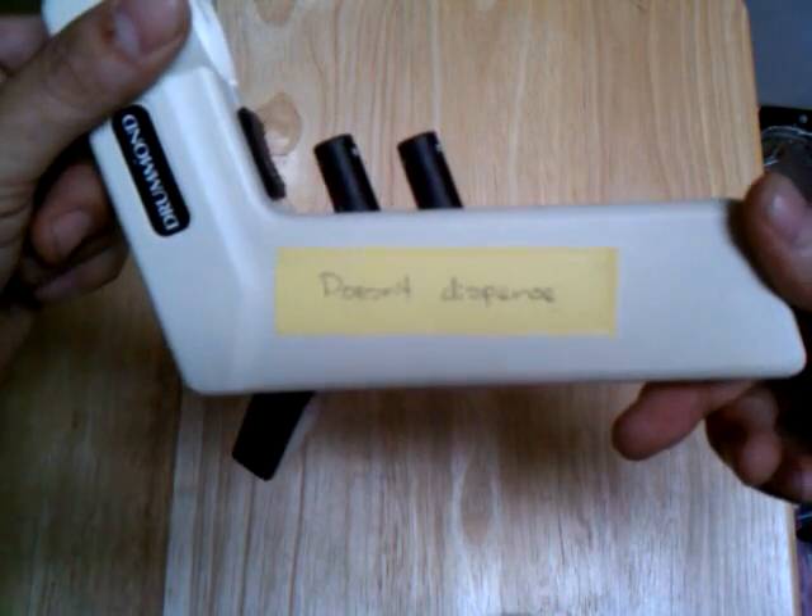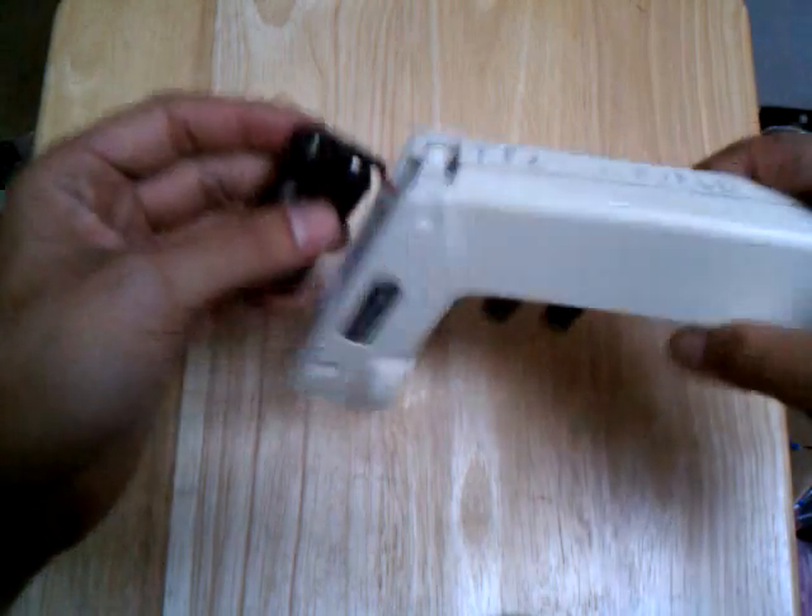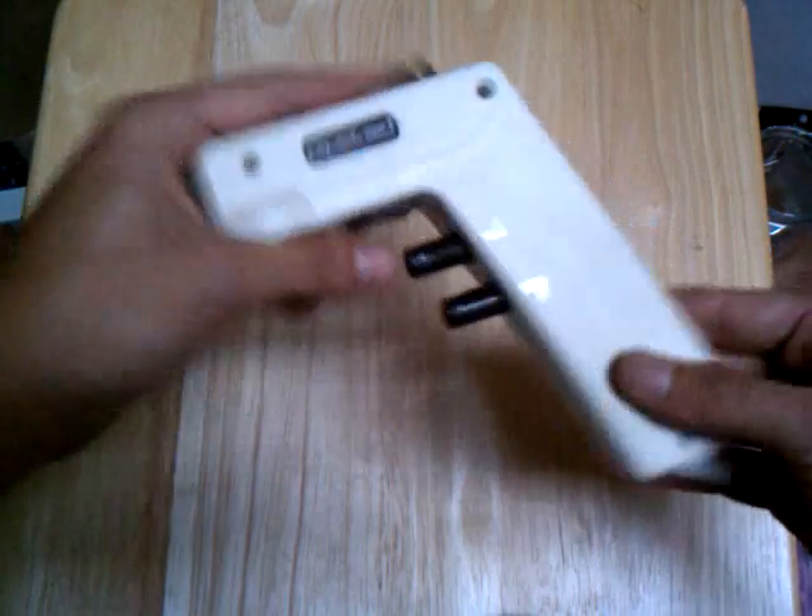This one was broken in the junk bin. It doesn't dispense, but that doesn't mean it's no good. As you can see, I've taken the liberty of popping it open already. Have a look.